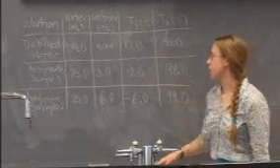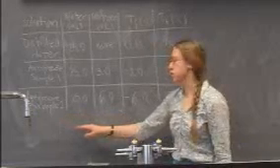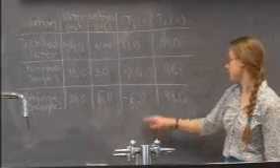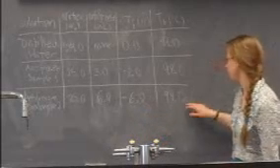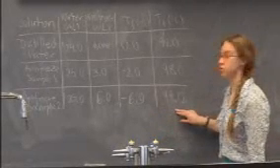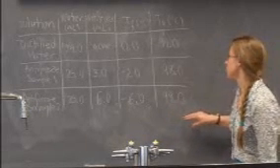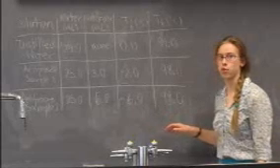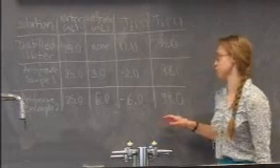And last, we have an antifreeze sample of higher concentration with 6 milliliters of antifreeze, and that froze at an even lower temperature and boiled at a higher temperature, negative 6 degrees Celsius for freezing and 99 degrees Celsius for boiling. So this is in accordance with the colligative properties we talked about, freezing point depression and boiling point elevation.